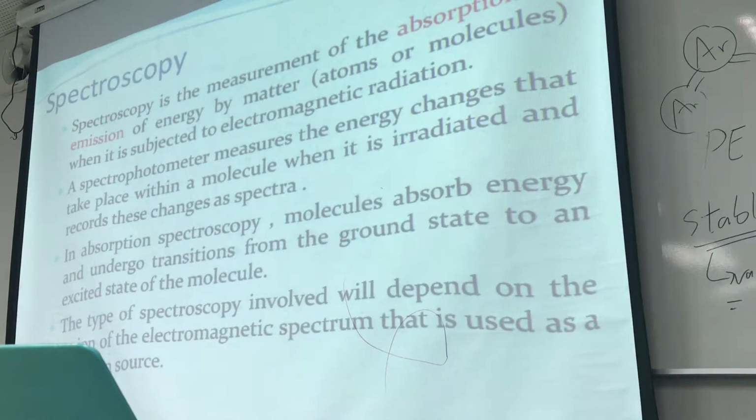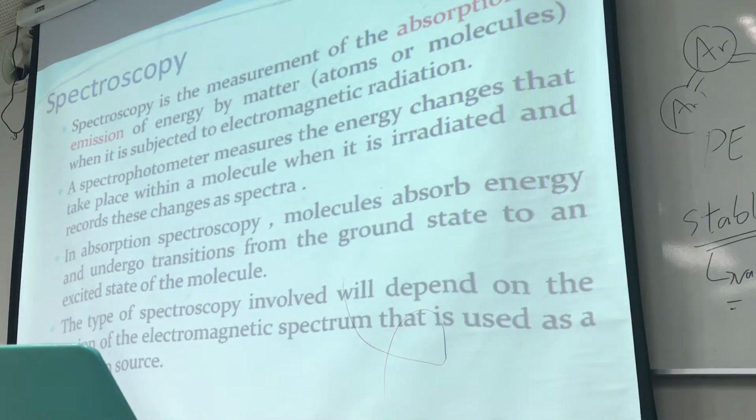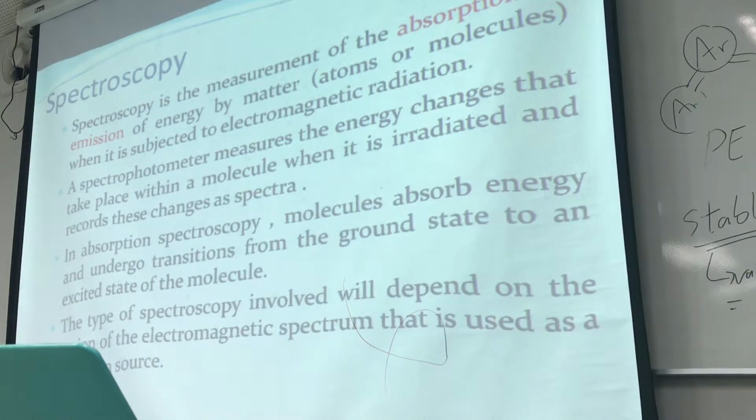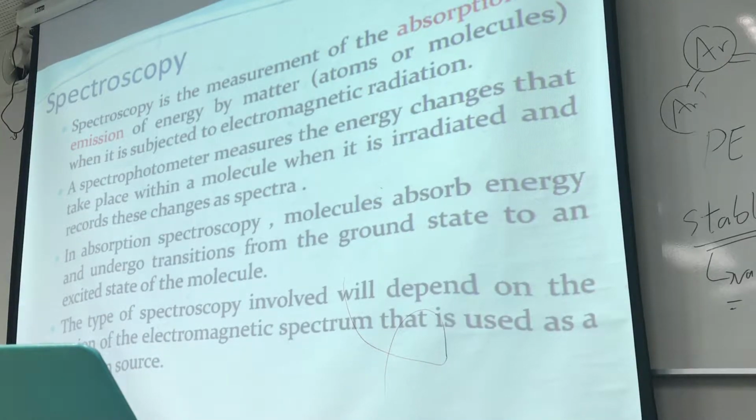What we have learned so far were the techniques to characterize the structure of the material. For XRD, we have the machine that gives you the X and Y axis, and then there are the peaks. On the X axis of XRD, or X-ray diffraction, we have the angle, and on the Y axis, we have the intensity, and we get the peaks. Those peaks can tell you the structure, what material it is, and how the material is arranged. Those are the structures of metals and ceramics.